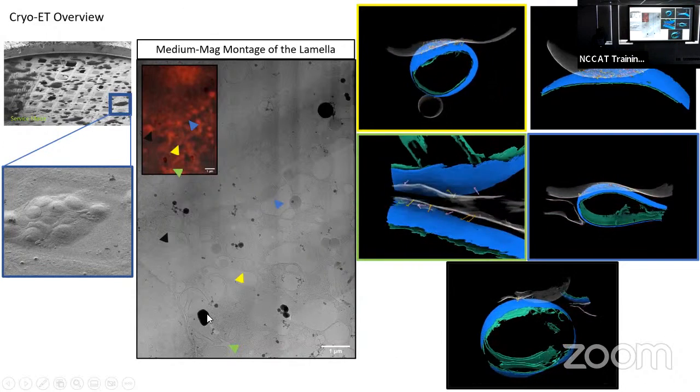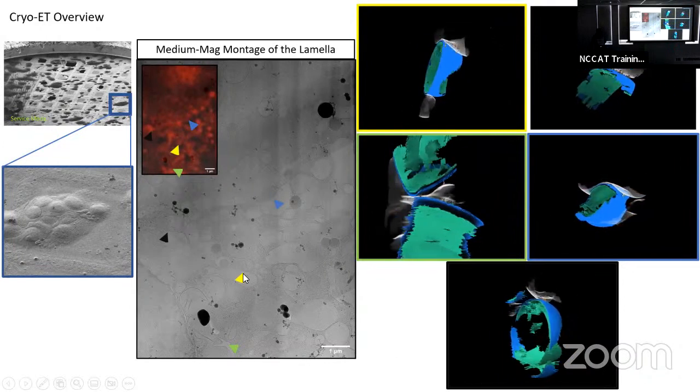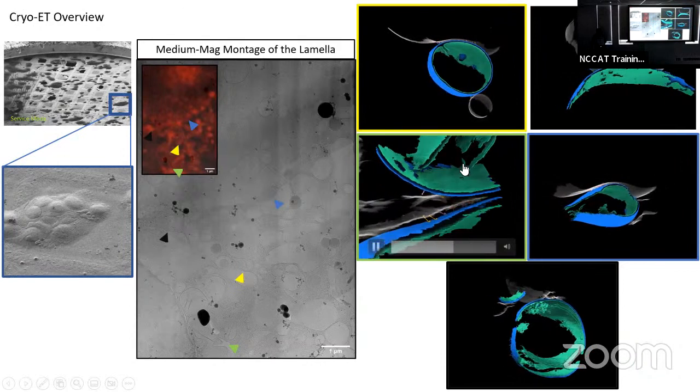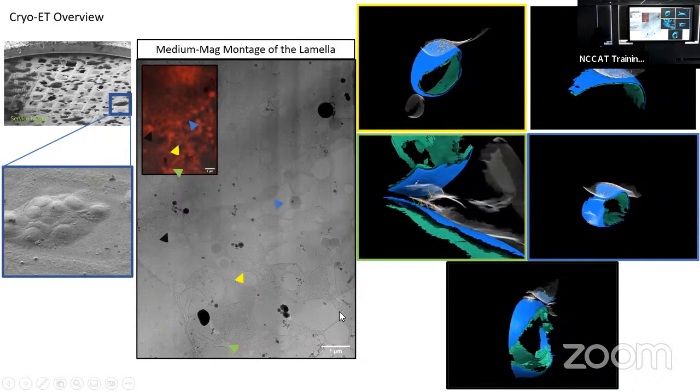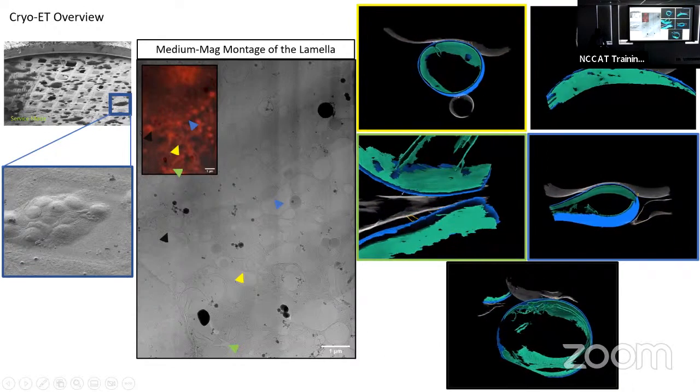And these are the tomograms from these targets. These are segmented and subtomogram averaged, so it's the final tomogram, not the initial tomogram, obviously.